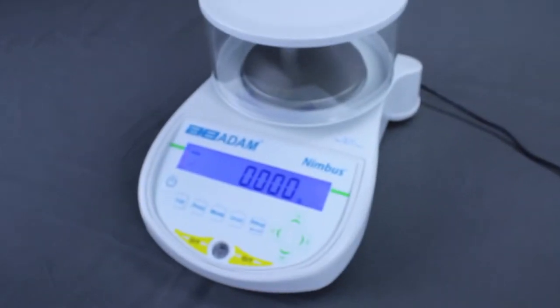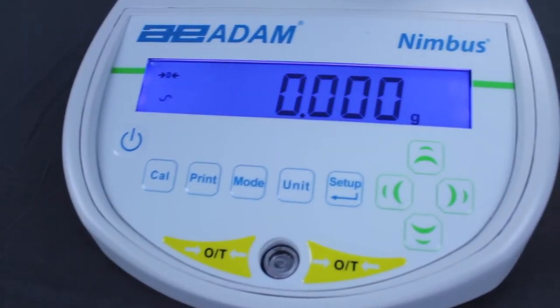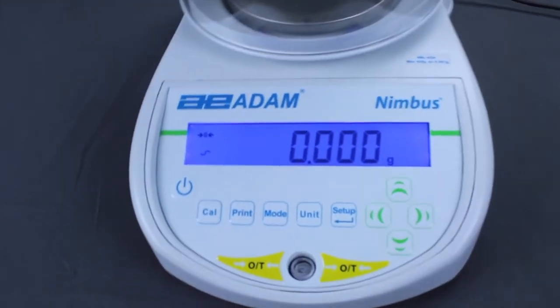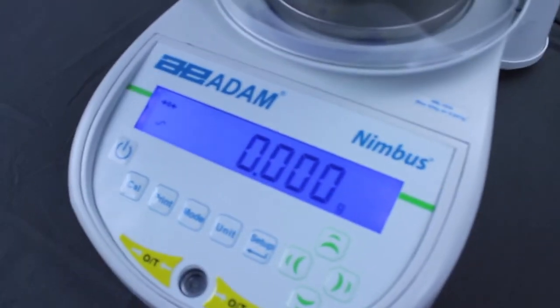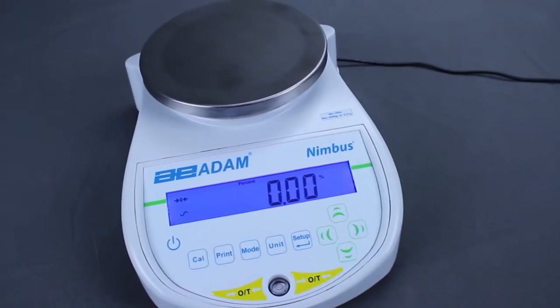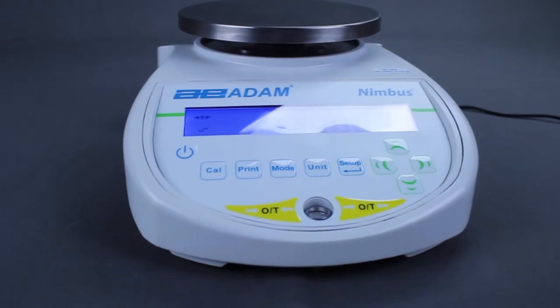Welcome to ADAM Equipment's Nimbus Dynamic Weighing Overview. The ADAM Nimbus can be set to weigh moving animals, also known as dynamic weighing. The balance will collect weight readings over a designated period, then display the average value.